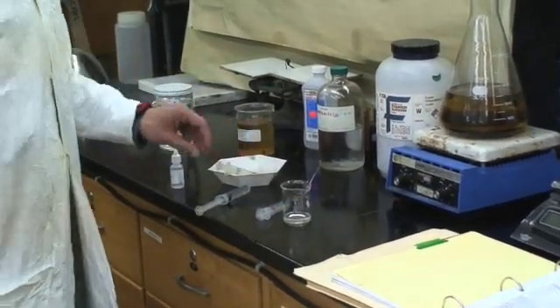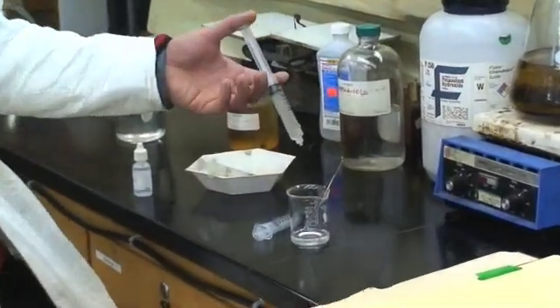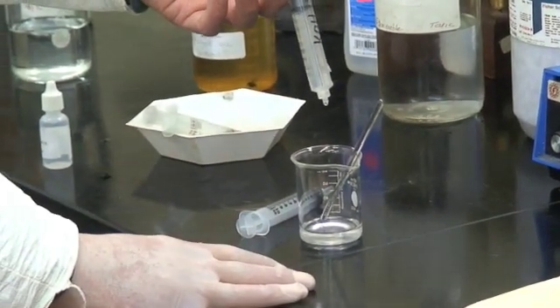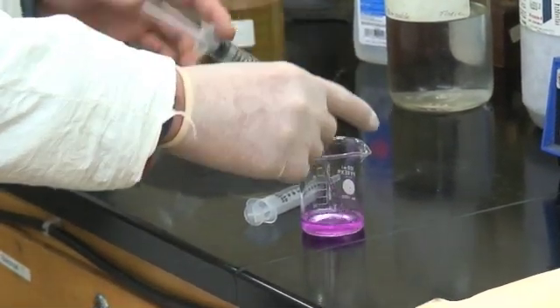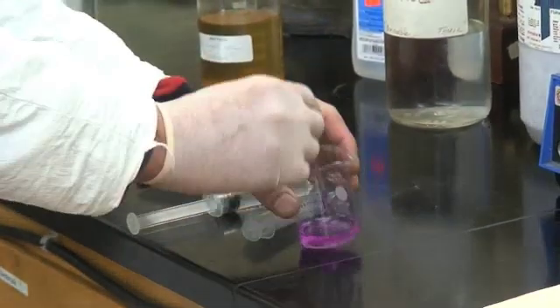We're going to add a few drops of the 1% KOH solution, which is 1% potassium hydroxide dissolved in 99% water. We're just going to do this to get a reaction here, until the color change — then we stir it.